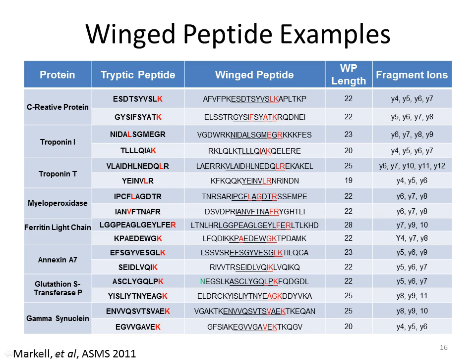So this is a study, again, there's an ASMS poster available, where we evaluated this winged peptide experiment because we're like, oh, this is great. If we could make this work, it'd be awesome. We had a bunch of proteins that we had synthetic tryptic peptides available for. So those are the ones shown here.